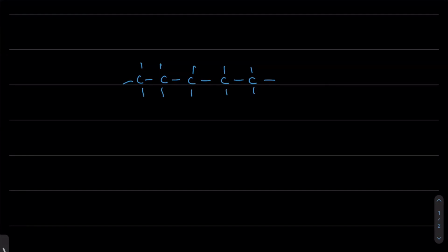One is carbon with 3 hydrogens. That is this one and this one. One is carbon with 2 hydrogens. That's this one and this one. But also this is attached to 2 carbons. So secondary carbon that is attached to a methyl on one side and a different carbon on the other side. Those are the only two I have. And the third environment that I have is of the middle carbon. So I have 3 different environments.